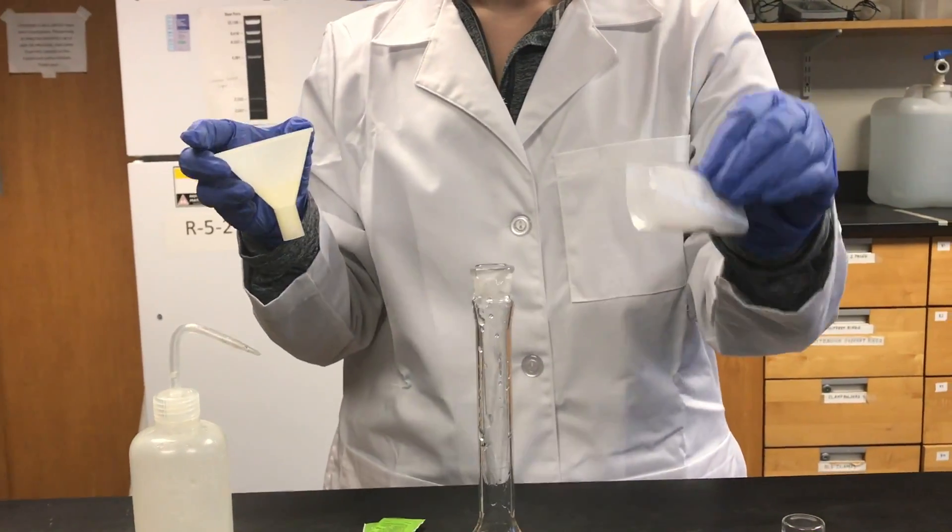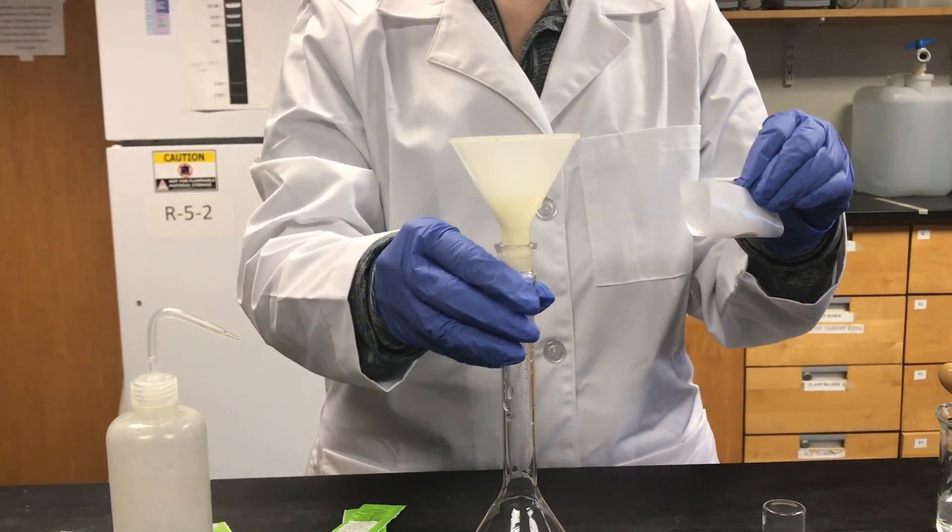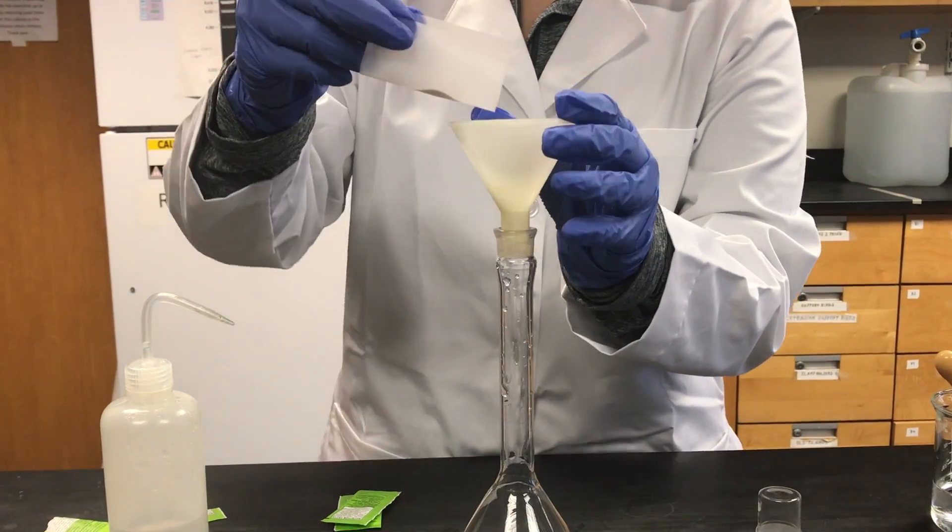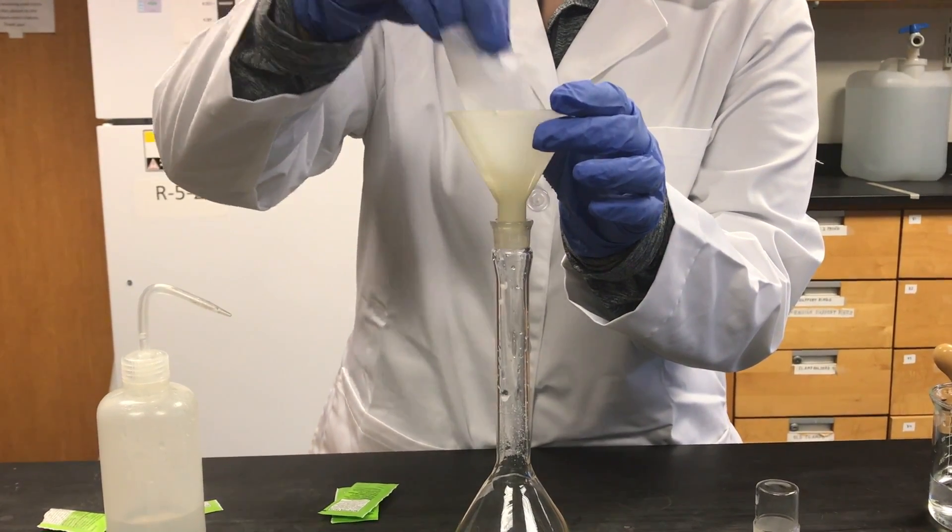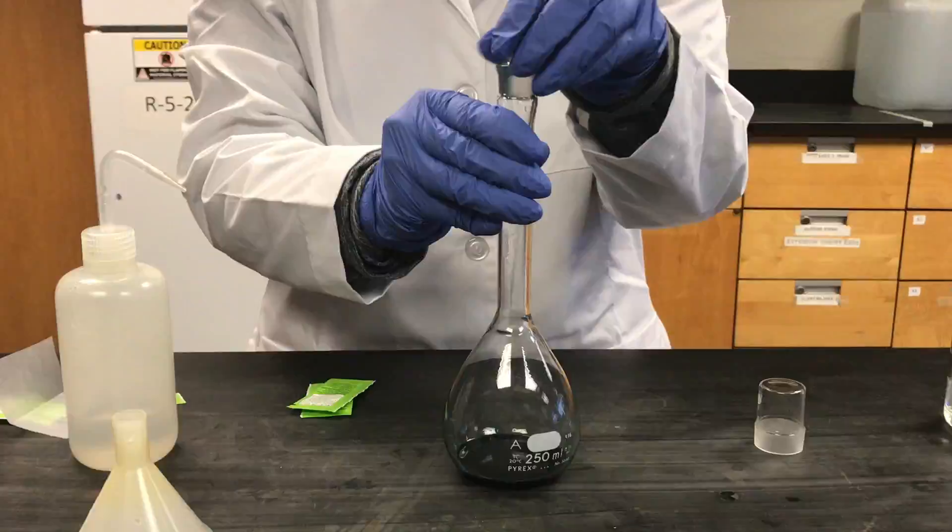For solid samples, place the plastic funnel into the volumetric flask and pour your sample in. This will ensure that none of the solid sample gets stuck in the stem of the funnel.